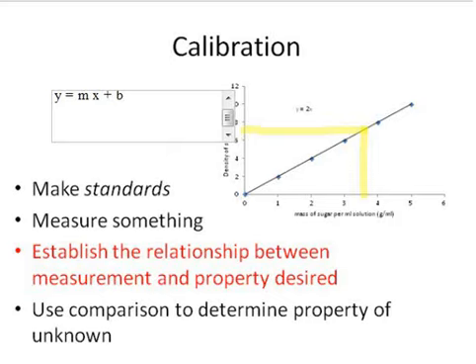And I should be making air quotes when I say nutritional information, because there's not much about Coke that's particularly nutritious. So we're going to use this whole process of the calibration to make this measurement, and it's very important that you understand all the pieces of it. So you make the standards in the laboratory, you do the measurements on the standards, you create this graph, you put the line on the graph, you use the line to establish the relationship between the unknown's measured value and the unknown and desired value.